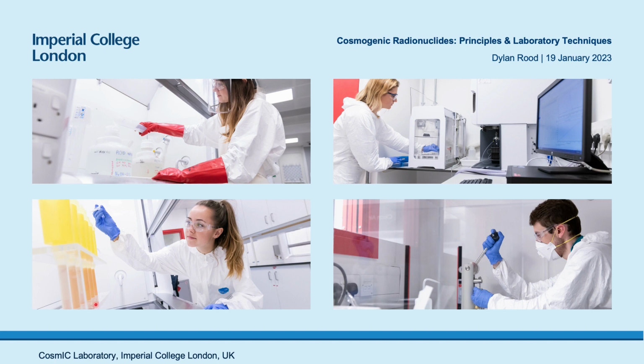This is ion exchange chromatography that we use for these coastal samples. If you've seen these in other labs, these probably look like they're on steroids. They look really big because they are really big. We use large columns because we have large cation loads that we have to deal with, and I'll explain that in a second. These are essential for these large and potentially dirty samples, meaning high cation load samples, that you have to use for these coastal applications because the nuclide concentrations are so low. And then we have specified places where we do the target preparation, working with beryllium, which is a hazardous material itself, but aiming for the cleanest and most reproducible results possible.